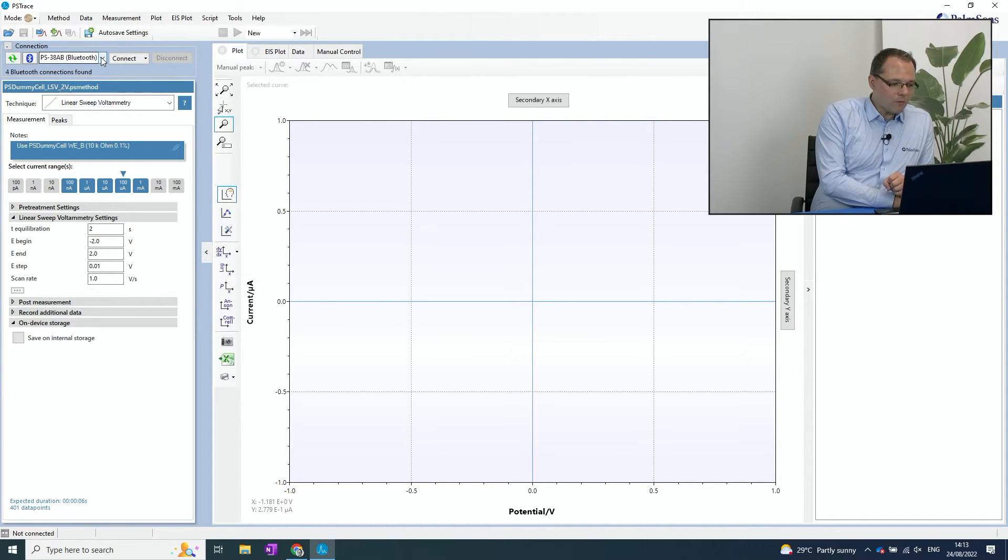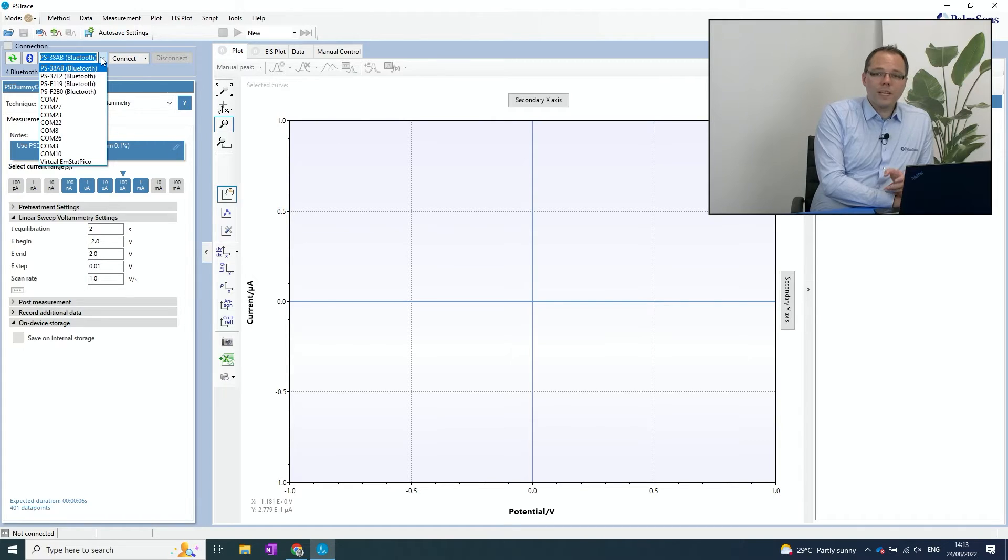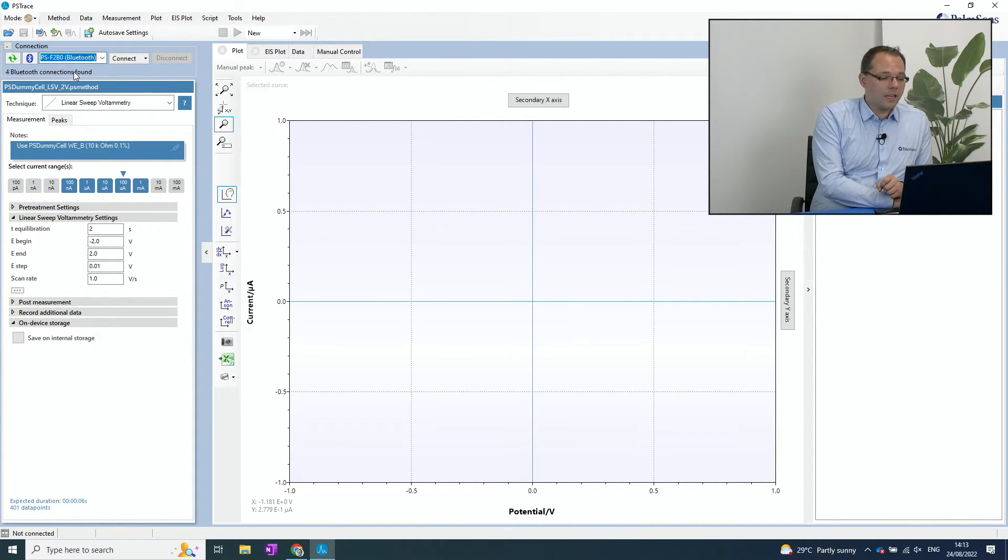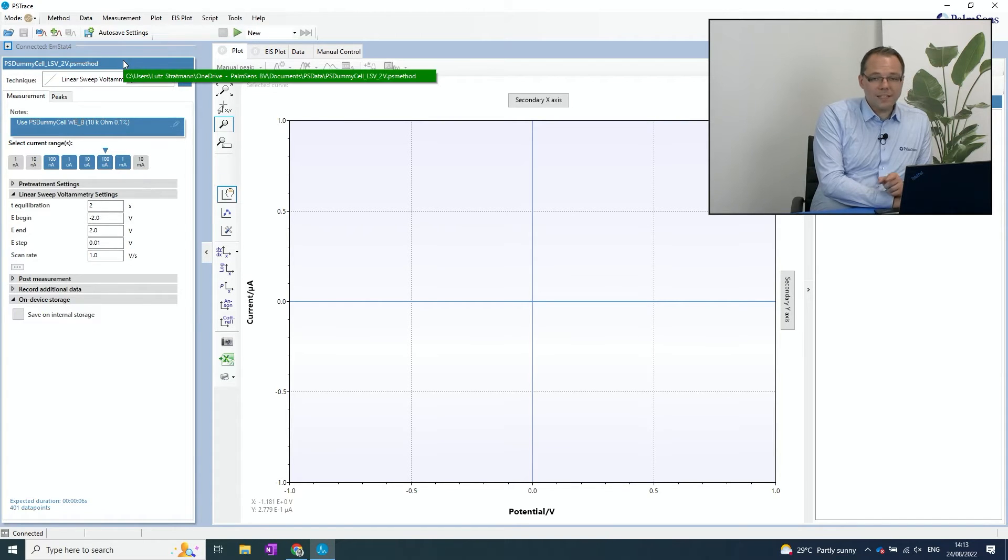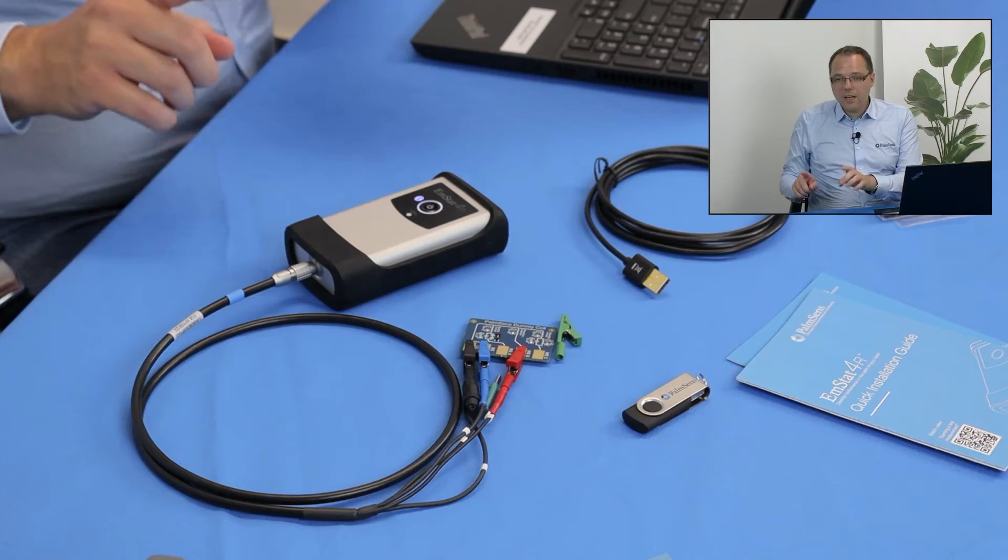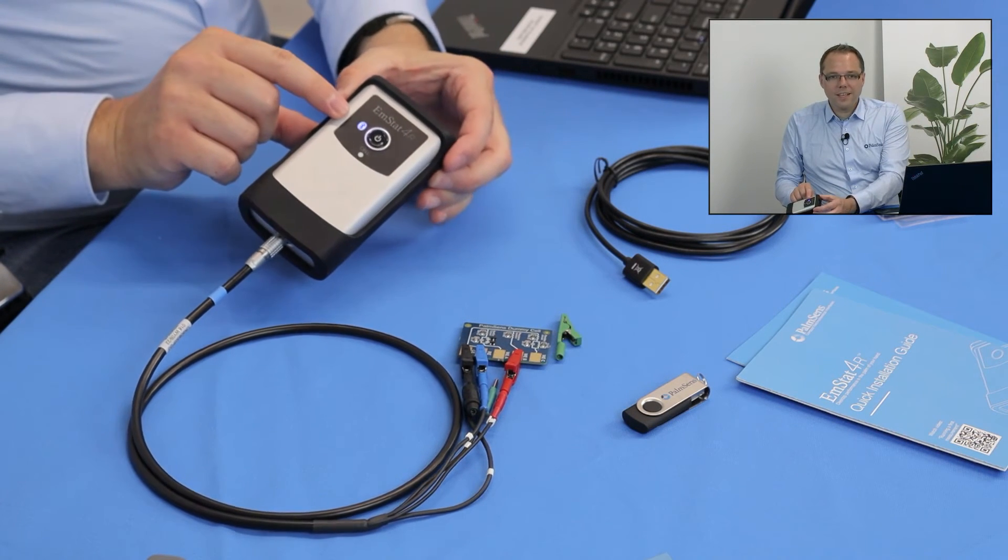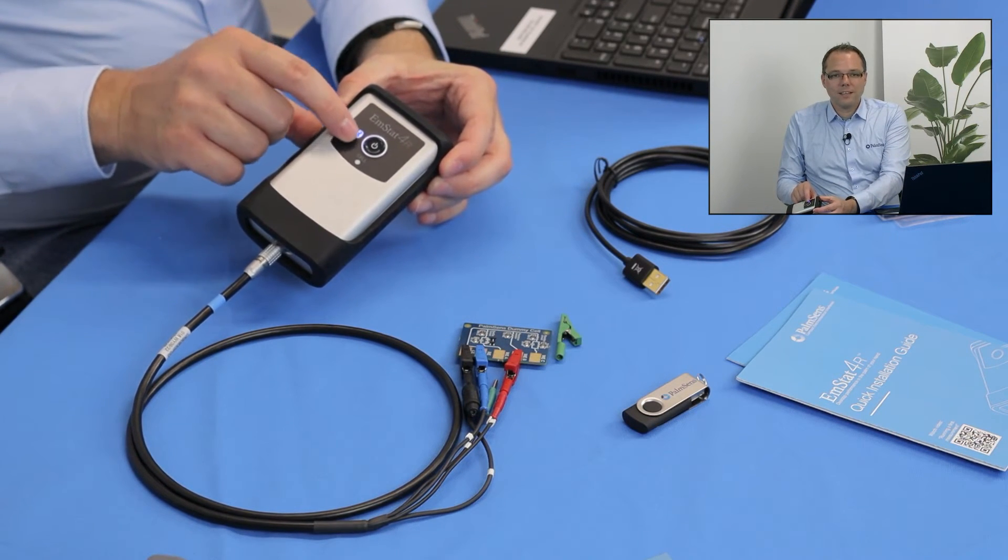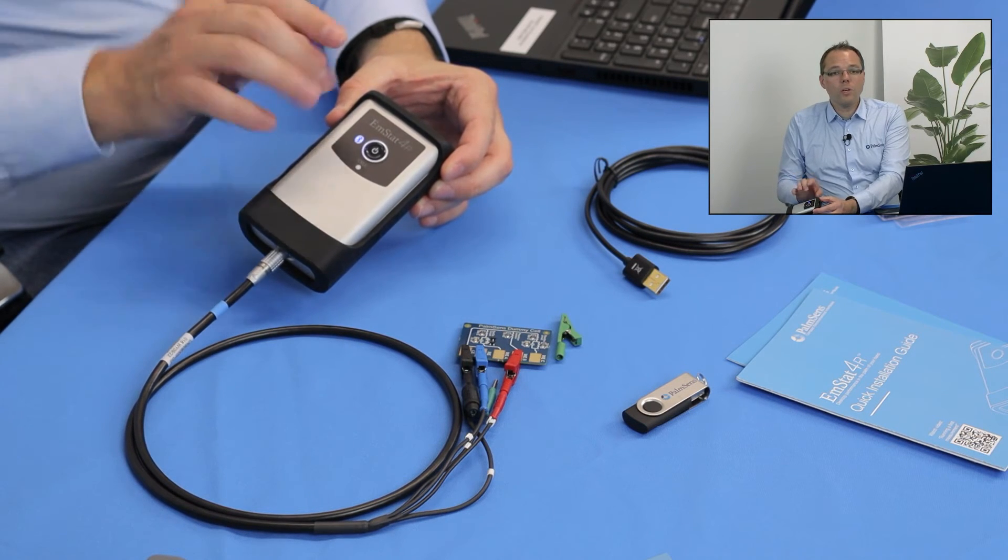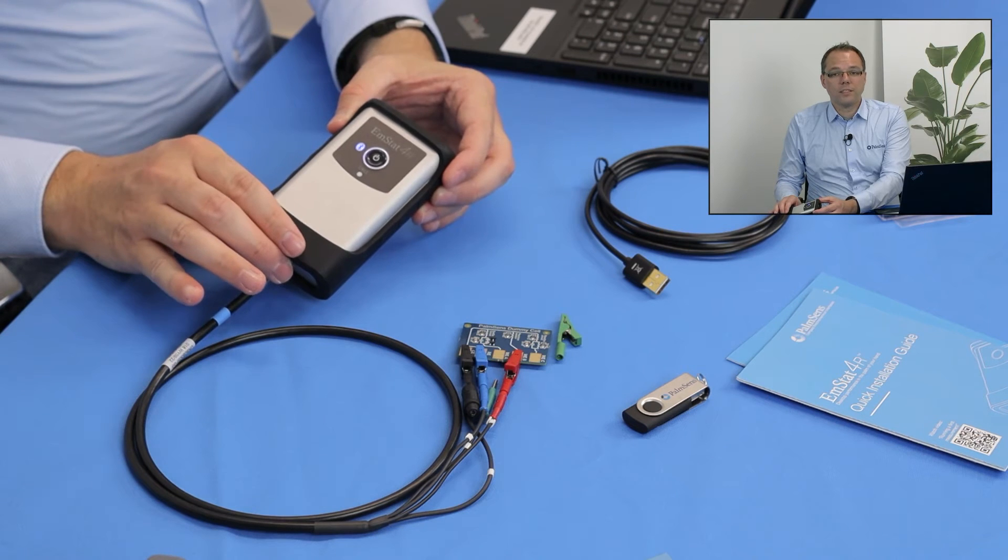Now it found multiple instruments and you can find on the back of your instrument the MAC number and the last four numbers and letters of that number are shown here in the drop-down menu as well. So you can easily identify the instrument that you want to connect. Then I press the connect button and once the instrument is connected, you can also check that on your instrument by the blue light that now illuminates the Bluetooth icon. Now we know this potentiostat is the one that is connected via Bluetooth.